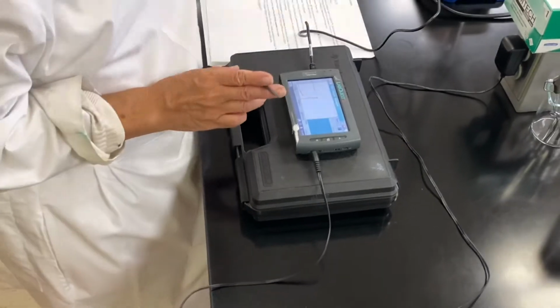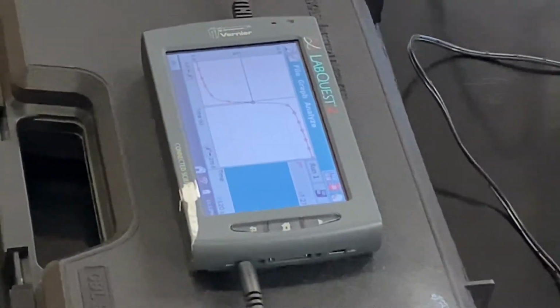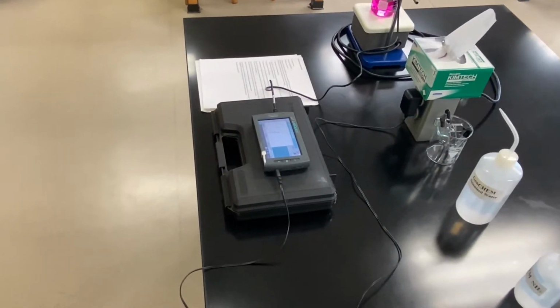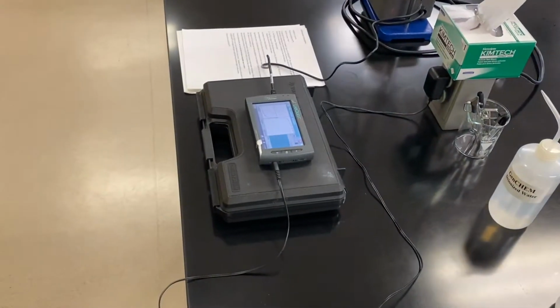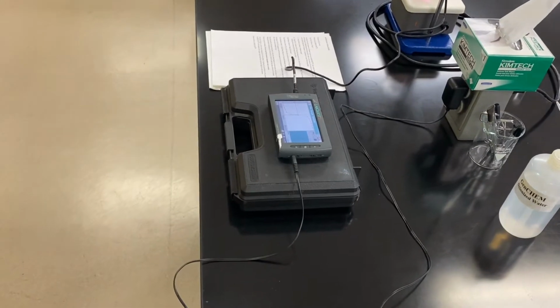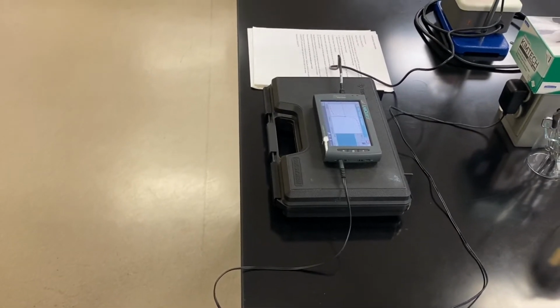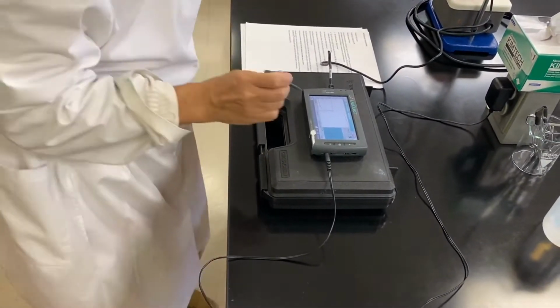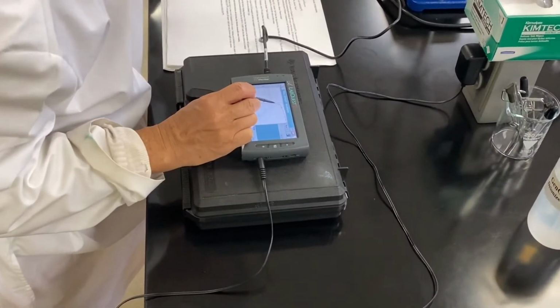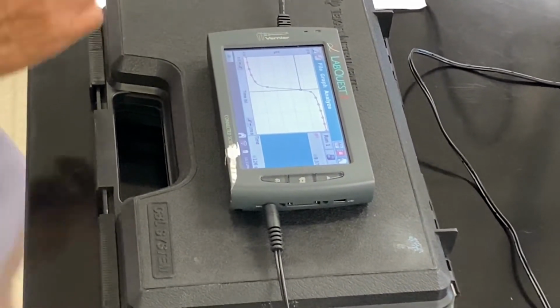All right, so now at the equivalency point, we have our pH, I, J, K. Now we're going to see at the pH equals 9, which is K. All right. After taking the observations, we will proceed to exploration 2.